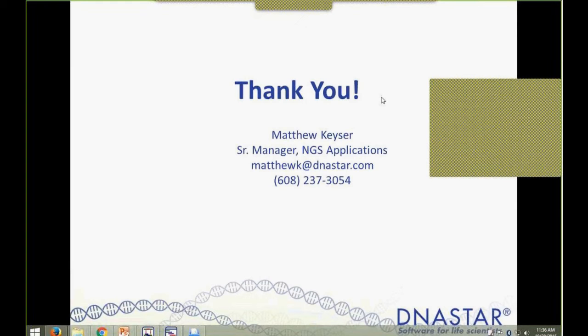The key really is to get a data set that has answers that are 100% accurate. If your answers aren't 100% accurate, then your accuracy will be less than 100%.